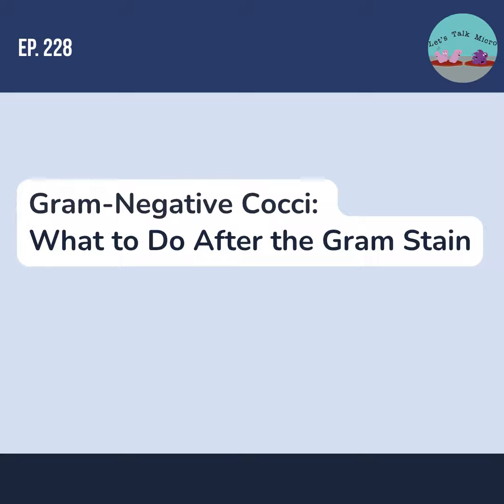And when I mentioned decolorization issues, one thing is with Neisseria meningitidis, which can resist being decolorized because of capsules and pili. And this decolorization issue is something that we also see very classically with Acinetobacter baumannii. So that's something that we have to keep in mind because with Acinetobacter baumannii, you will see sometimes that it retains that purple in the gram stain.